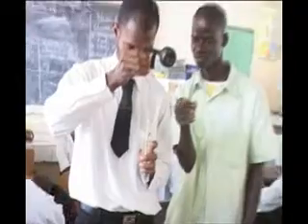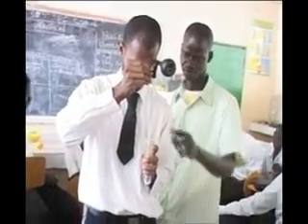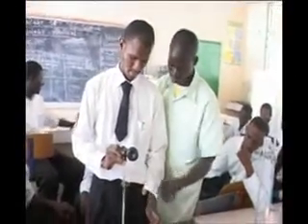2 centimeter cube. Observe. Only 2 centimeter cube. Okay, go up to 7. So now he has moved from here to here. So meaning the 2 centimeter cube has been dropped in the test tube. Then the next thing is drop the liquid.